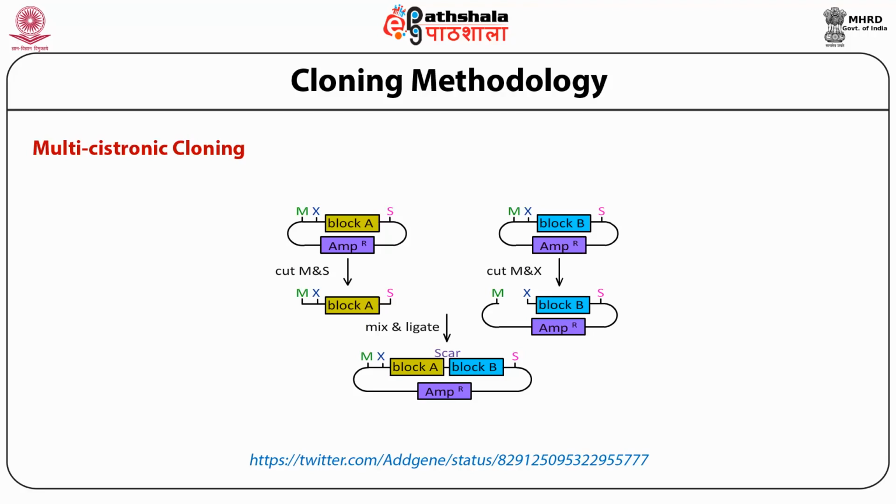This particular cloning system is very useful in a molecular biology application where we want 3 different proteins to be expressed at 3 different levels, or at a variable expression level. So we can manipulate that by having 3 kinds of promoters for each of these genes. Just a simple schematic of how 2 genes could be simultaneously cloned into the same vector. Here is the schematic of that.